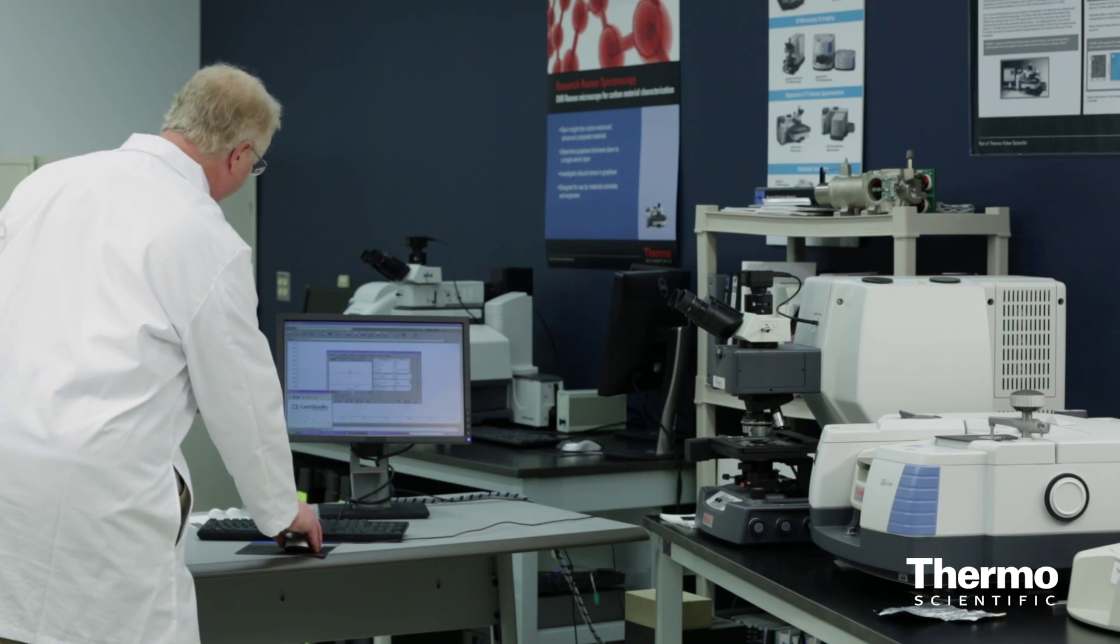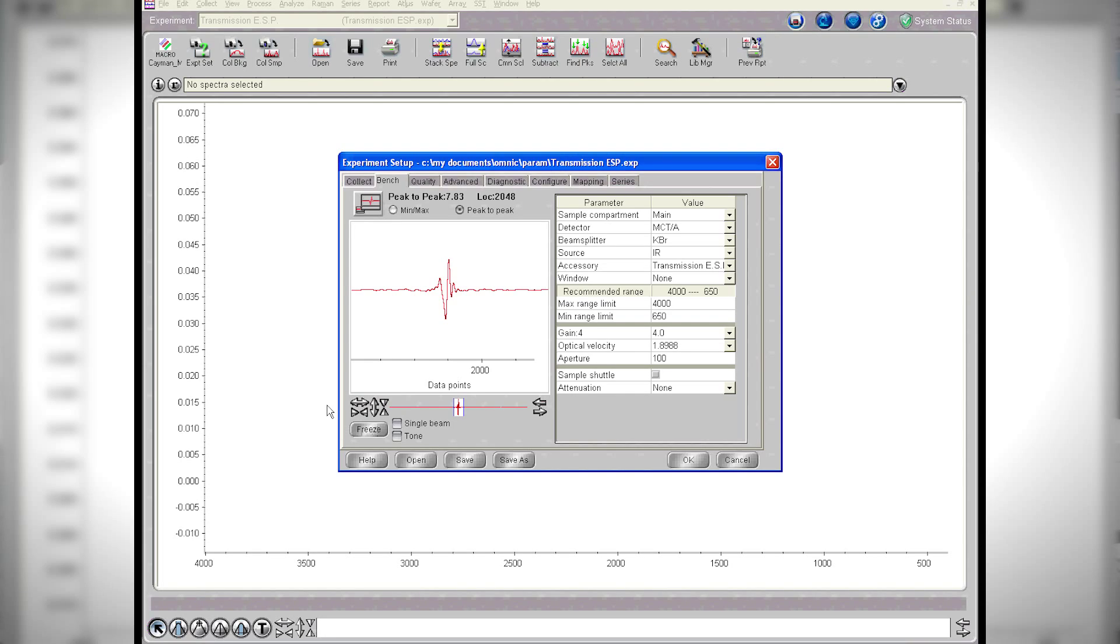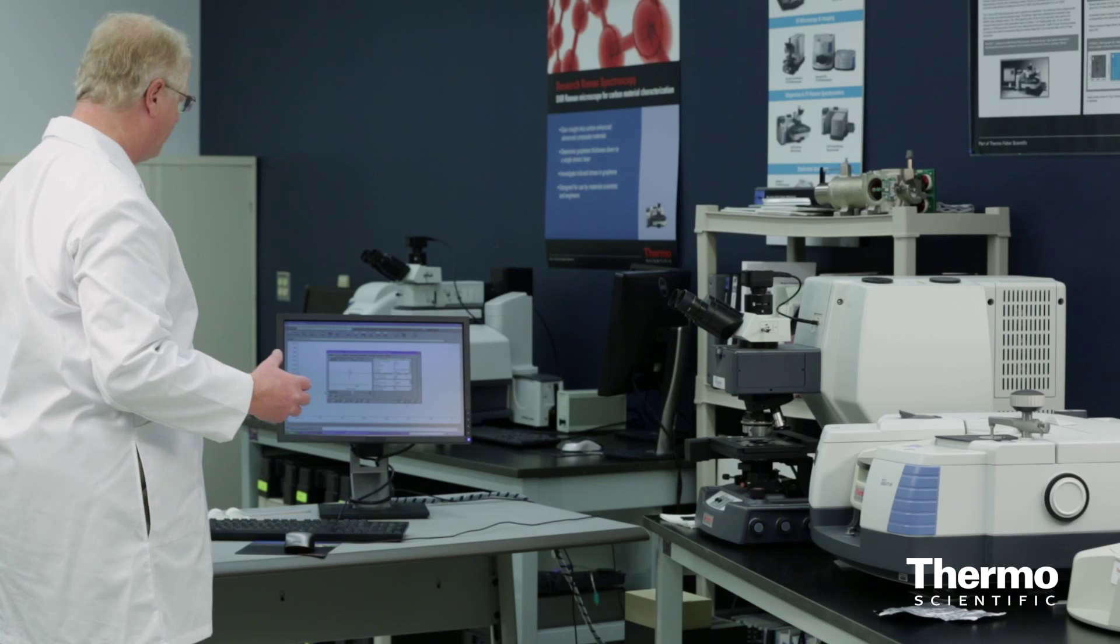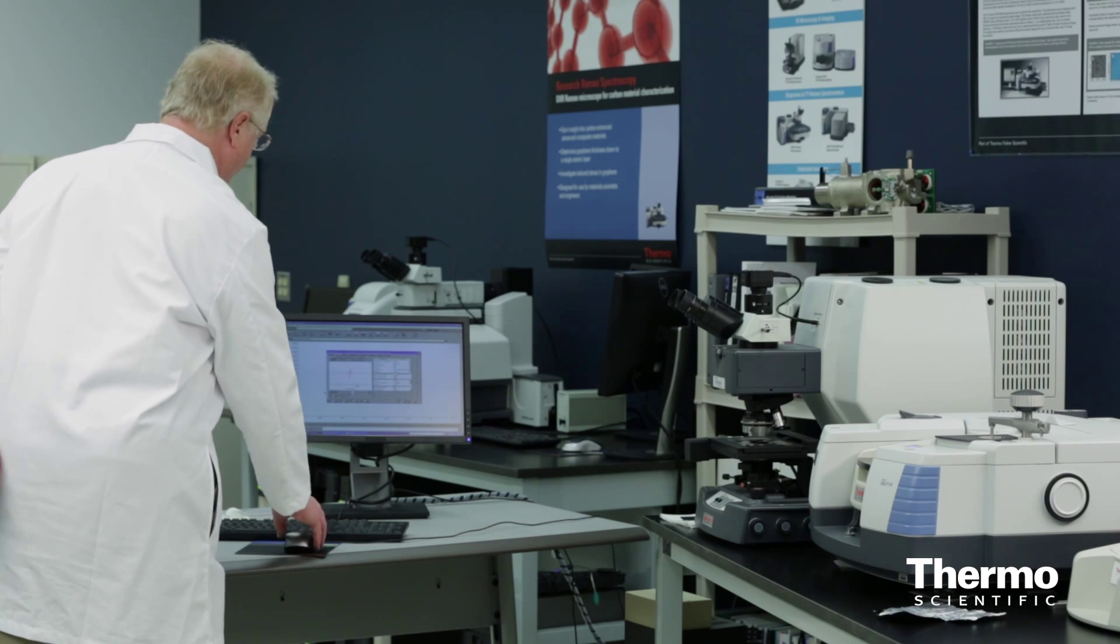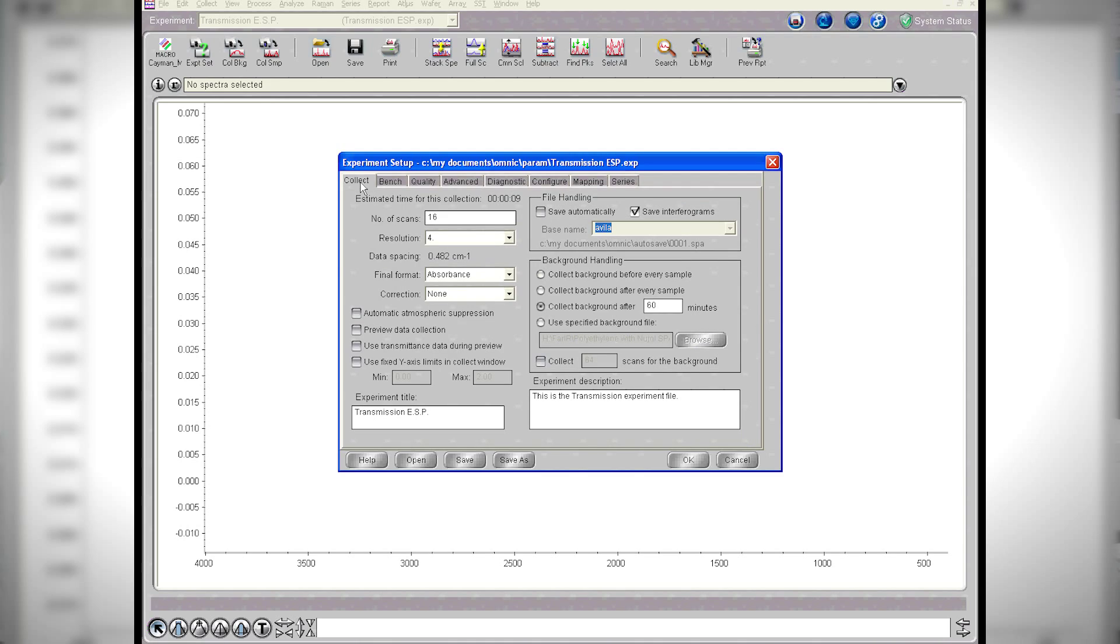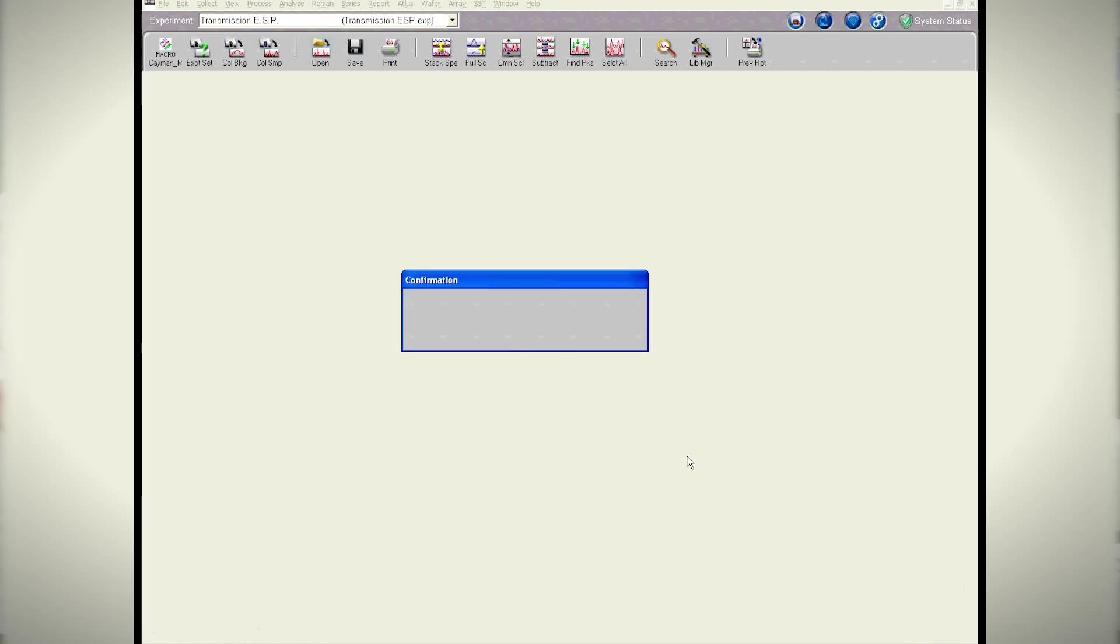Now let's move over to the instrument. You can see here on the instrument that I've got it set up to use the mercury cadmium telluride or MCT detector. I'm going to be collecting the data fairly quickly at a moderate resolution of only four wavenumbers. I'm going to collect 16 scans. So now I'm going to go ahead and collect the background first.